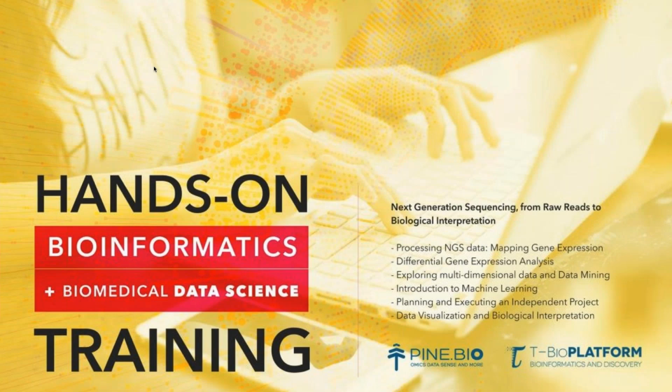Okay, note to everybody, the session is being recorded. And what I wanted to say is just a review of the course. We have already learned how to process next generation sequencing data, going from raw data to an expression table. And we already did differential gene expression and understood the statistics of the t-test. What exactly are we trying to measure?